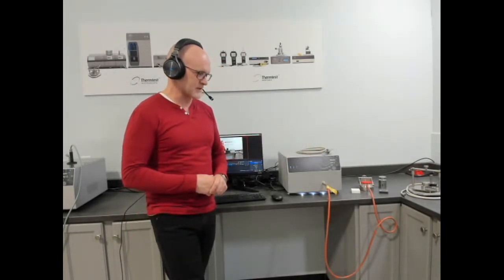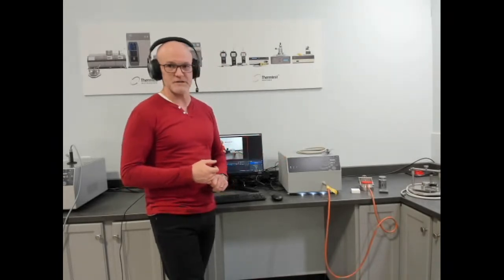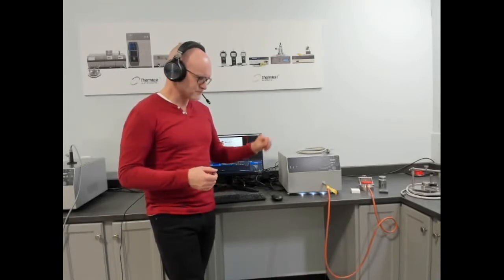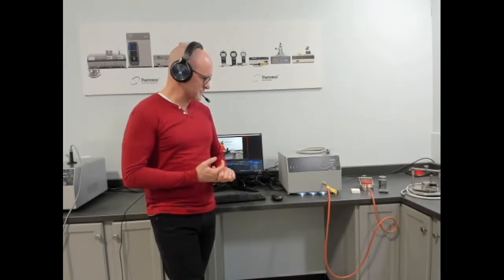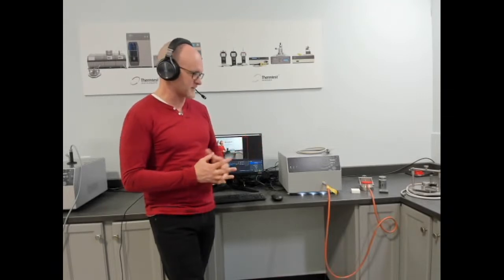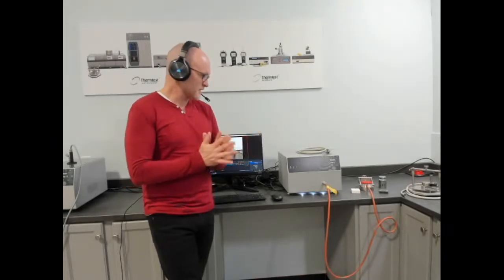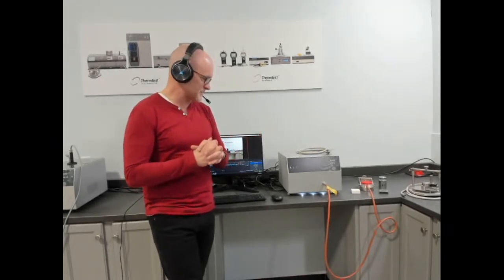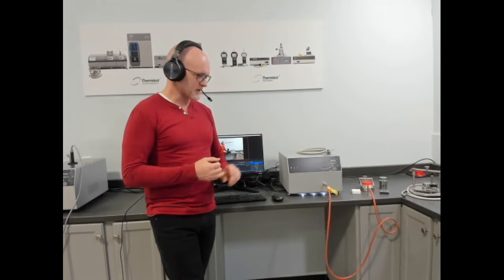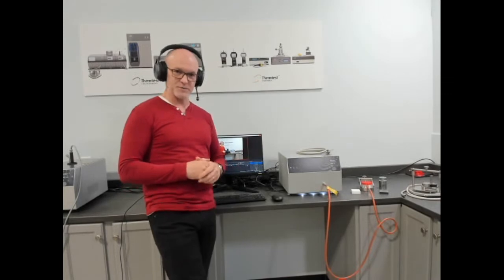The upgrade sensor that you can purchase with your MPV allows you to test up to 100 degrees under 20 bar, which is for testing up to boiling points and past boiling points. And then the last sensor we offer is the transient line source following ASTM 5334, the new 22A standard, and ASTM 5930 for testing soil and polymers. So what we're going to talk a little bit about today is specifically sample setup for bulk and slab on the MTPS sensor, and show you a quick measurement and some raw data and calculated results on that. So if we bring the camera in.